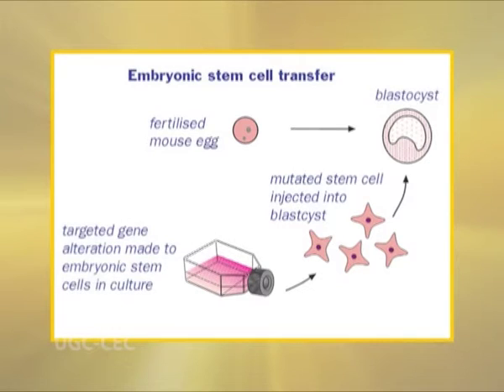The first step is the removal of embryonic stem cells from the blastocyst. After transfection of the embryonic stem cells, selection, cloning, and screening methods make it possible to detect embryonic cell clones that demonstrate the desired site-specific recombination. After microinjection of the genetically modified embryonic stem cells into blastocyst stage embryos, the embryonic stem cells divide and become part of the embryo. The following chimeric animals will subsequently transmit the recombinant genotype to their offspring if the embryonic stem cells have contributed to their germ cells.